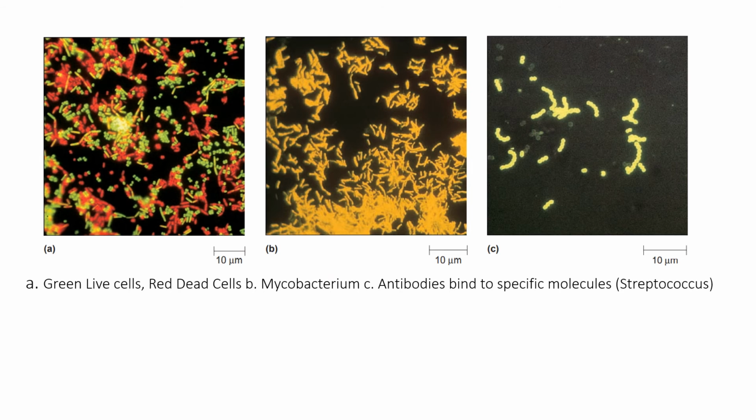Moving on to the last slide, we have three kinds of images. I want you to look at them, observe them, and see what all you can see. We have a black background, right? We have some finely colored, other than normal colors, bacteria or the organism present on the slide. Now these all are fluorescent light. Okay, that's how fluorescence looks under the microscope.